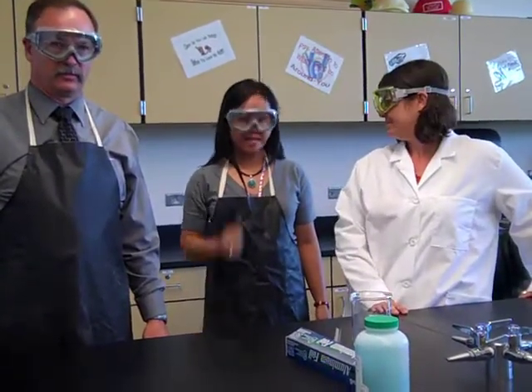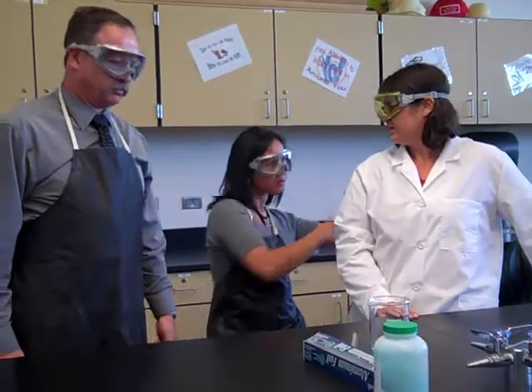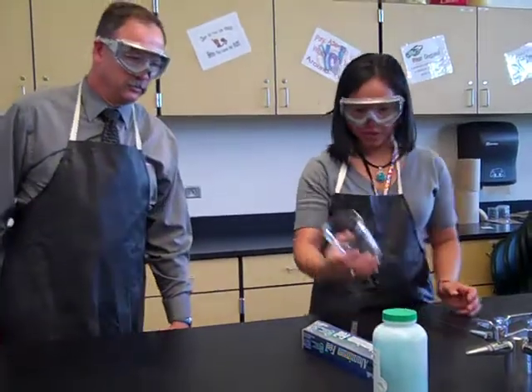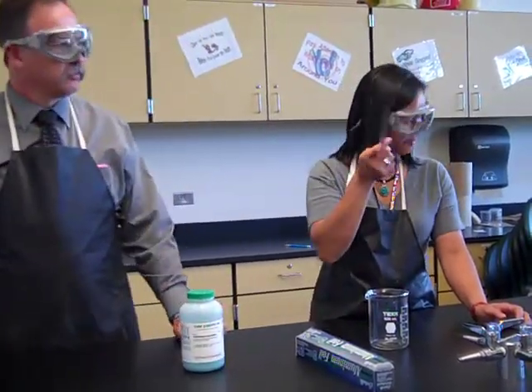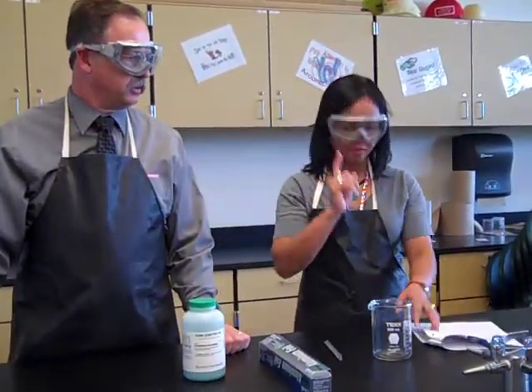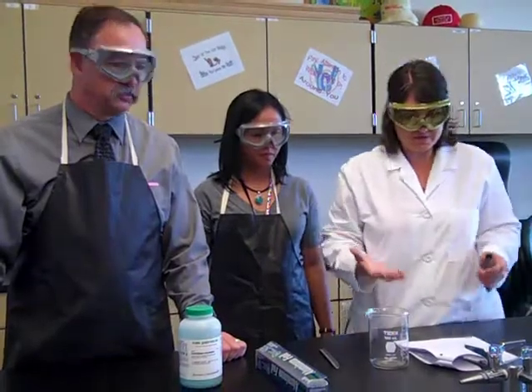We're doing some labs in chemistry class, so we want to make sure you know all the safety rules. I left my procedure over there — I'll get it. What do you have sitting up here? We have a beaker with some copper chloride, a spatula, some aluminum foil, and we need a thermometer. We have to follow the procedure; that's why I went to get it.